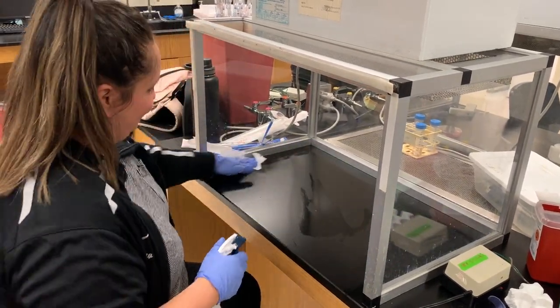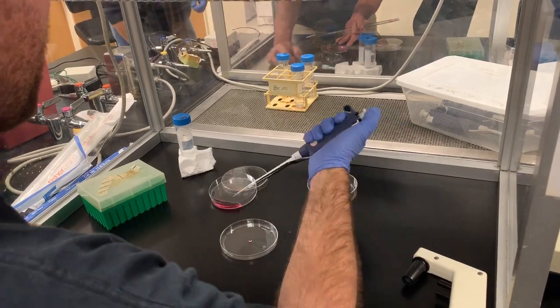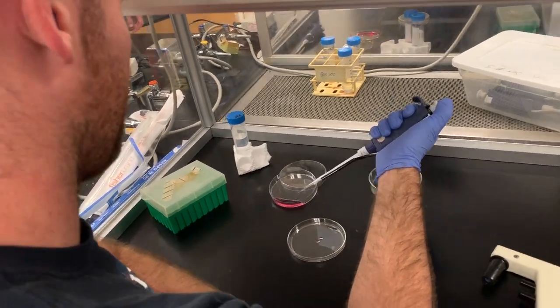First, disinfect your culture hood and equipment with 70% ethanol. Once your equipment is disinfected and ready, you can begin plating your cells.